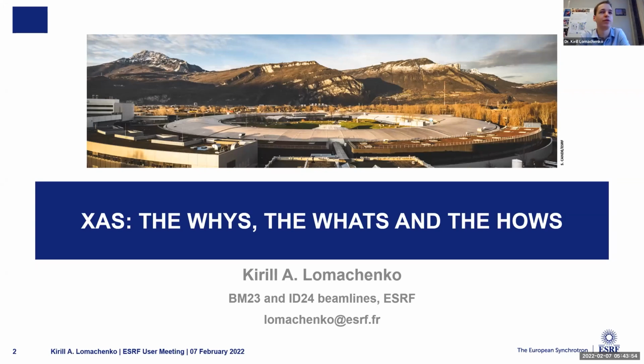So if you measure, for example, a titanium zirconium alloy, and you measure titanium, you have 1% of titanium on zirconia, something like this. Then of course your total absorption will be very high, because zirconium absorbs a lot at 5 kiloelectron volts, where there is a titanium edge. And the data quality will be pretty low. It's much better to measure 1% of zirconium on titania than 1% of titanium on zirconia.